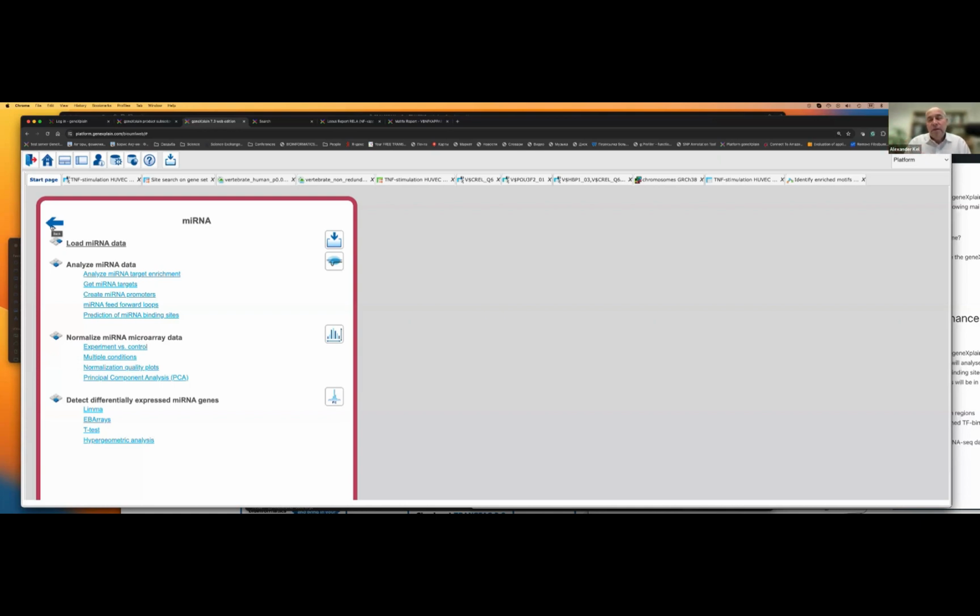For many microRNAs it is still not clear what they are doing, so you very rarely can put them in GO categories or disease categories. But they all have promoters, right? They are expressed from some genes, and those promoters are available for analysis of transcription factor binding sites. In that respect, our tools do a very unique type of analysis of microRNAs, analyzing their promoters to understand how these microRNAs are regulated, and why they are upregulated, for instance.